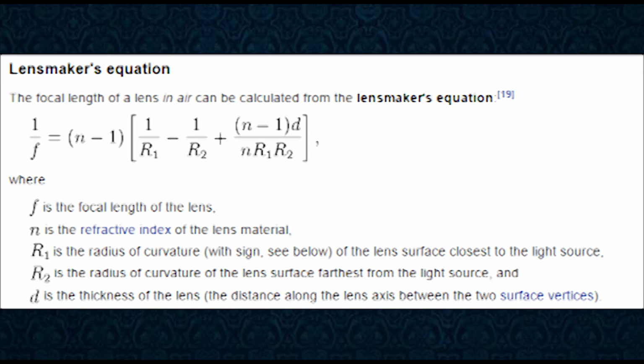It had been known for many years that electron beams could be warped through the application of a magnetic field, but in 1926, Dr. Hans Busch proposed that cathode rays, that is to say electron beams, could be focused by magnetic fields in the same way that light can be focused by transparent lenses. Furthermore, he showed that the lensmaker's equation, shown here, could be applied to electrons as well under certain conditions.